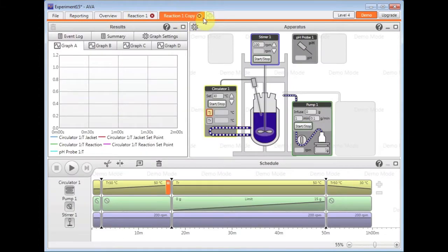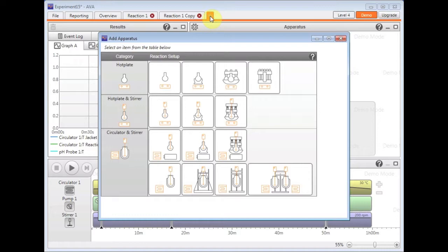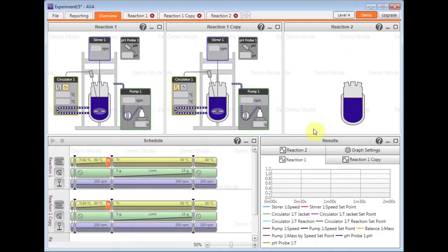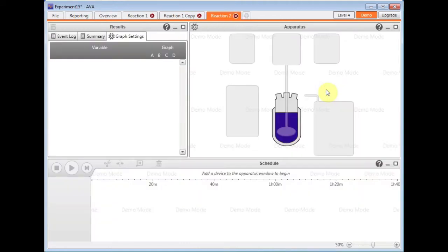Or another approach you can do is add another configuration to your setup. So control another vessel and then add the devices that you wish to control within that window there. So like I said, you can control up to four systems in parallel.